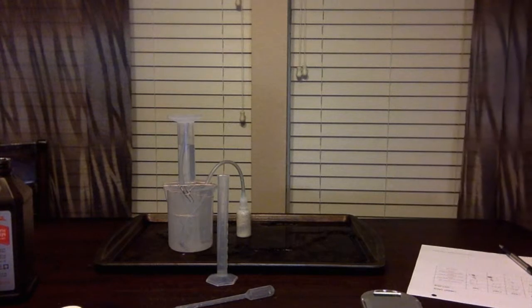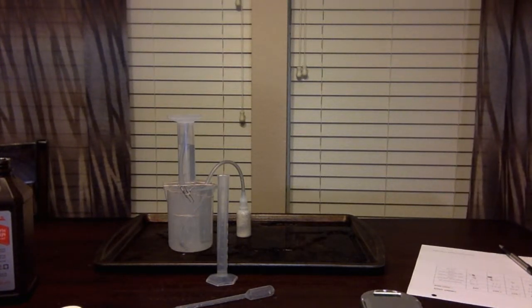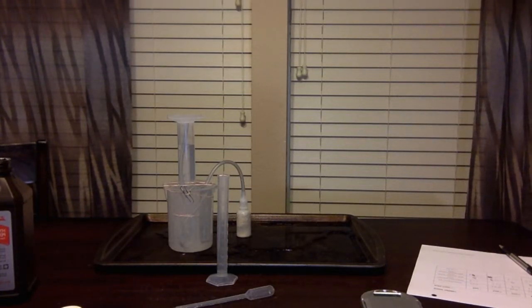All right, guys, it looks like it's reached a steady 15 milliliters of O2. We're going to give it a couple more seconds to see if it stays steady at 15 milliliters. All right, guys.